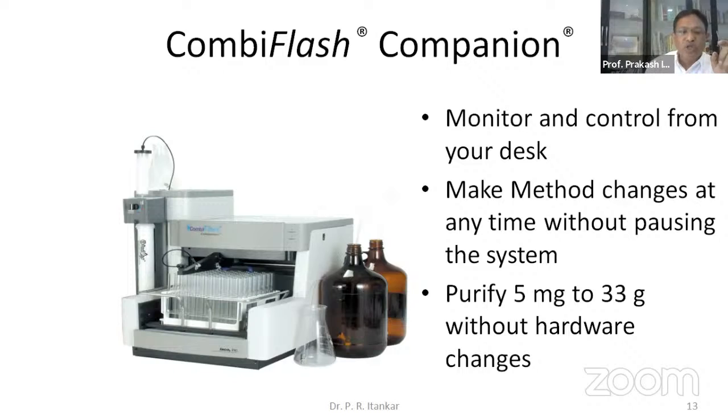The sample loading and column sizes are made available by this company, Teledyne ISCO from the USA.